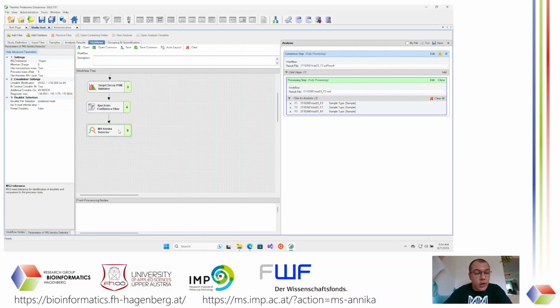This basically comes down to your crosslinker, what exactly you have to specify here in the crosslinker settings. For DSSO, this is what you want to choose. For most crosslinkers, you don't have to specify additional crosslink doublet distances. You will only have to specify the crosslink modification here. But if you're unsure, it's best to talk to whoever is selling you the crosslinker or whoever designed the crosslinker.